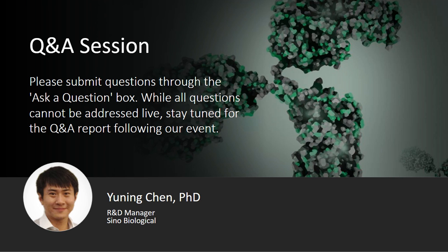Okay, to pick a favorite. Every antibody is unique, even for the IgG1, sometimes we do see strange behaviors between different preparations or between different constructs. If I would have to, I'll answer the second part. For the antibodies that we've made so far, the IgMs are definitely the most challenging because they're huge molecules to begin with, and we have to ensure their purity as well as make sure that they reach the correct oligomerization status. So it will be a little bit more challenging to both produce and purify these proteins.